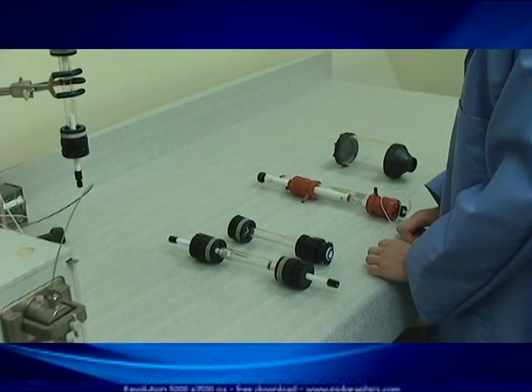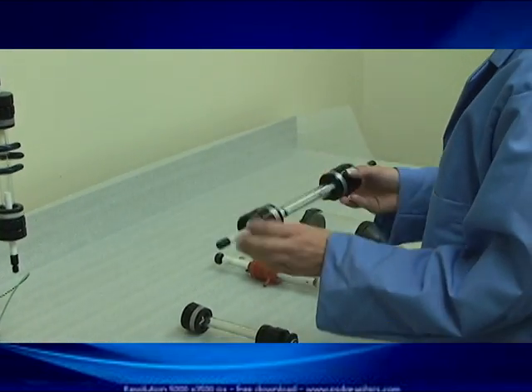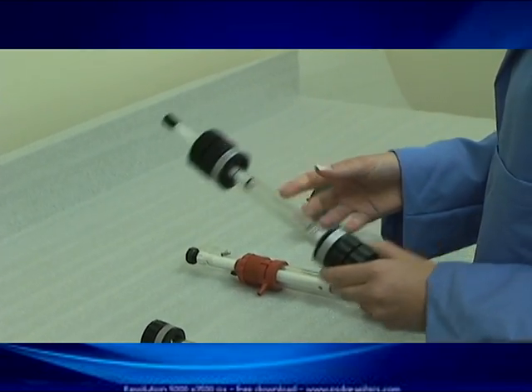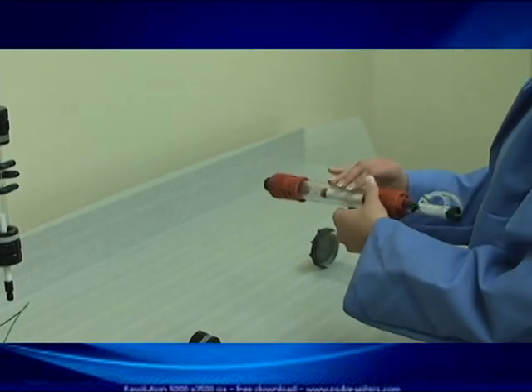What we want to do today is to demonstrate the fundamental differences between these two columns. The black column is our product at Essential Life Solutions — this is our Econoline column, which is our most popular column and the one we recommend for most FPLC applications. The other column, the red one, is a commonly used product on the market.